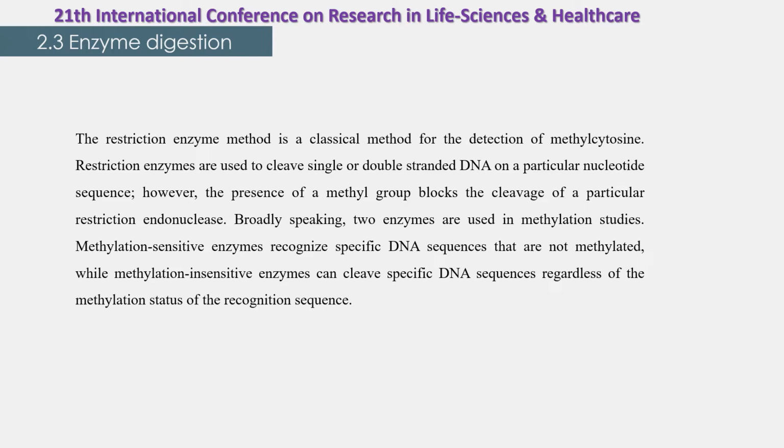Broadly speaking, two enzymes are used in methylation studies. Methylation-sensitive enzymes recognize specific DNA sequences that are not methylated, while methylation-insensitive enzymes can cleave specific DNA sequences regardless of the methylation status of the recognition sequences.